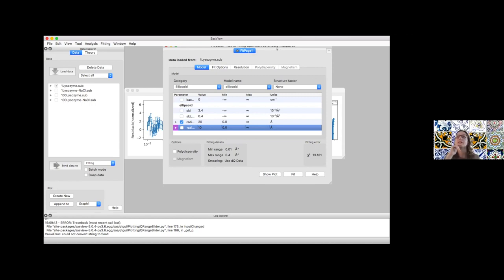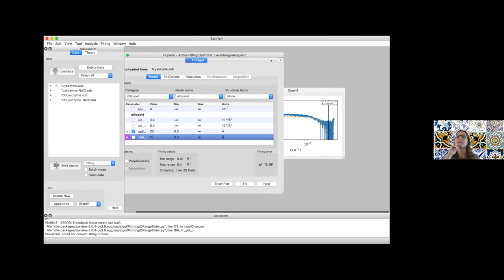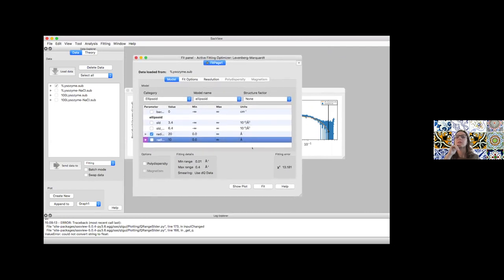And then let's have a look at your plot. Hopefully, it should have limited the range. Yeah, there we go. It's between those two black lines at the window behind it. You can see the... You want to see the plot or? Yeah. It's the window behind it, behind that. Right.